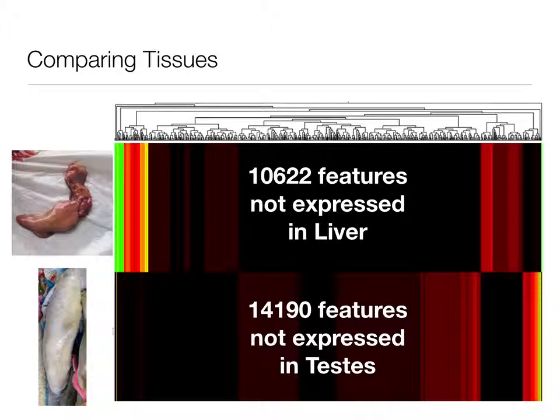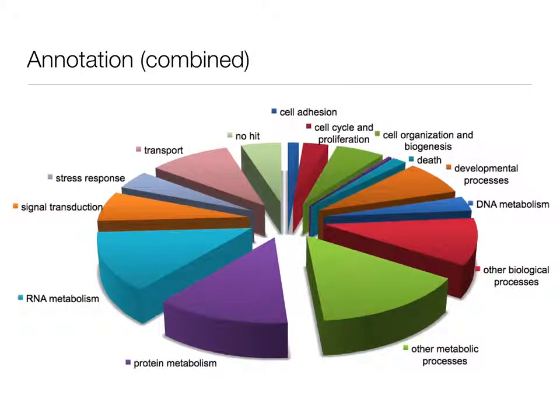So this is just features, which was a way of saying genes, very analogous to what you could look at. This is another great example. We talked about these terms, but this is one way to take a whole transcriptome, remember, annotate it with BLAST, and then connect it with gene ontology. Gene ontology is a hierarchical system, and at the very top we call them GO slim terms.